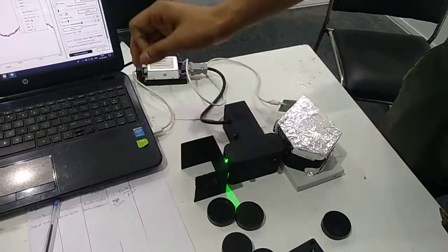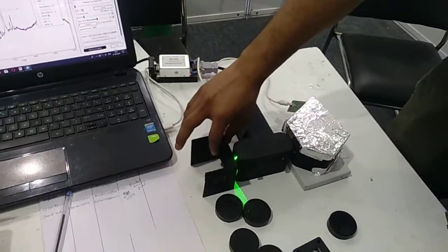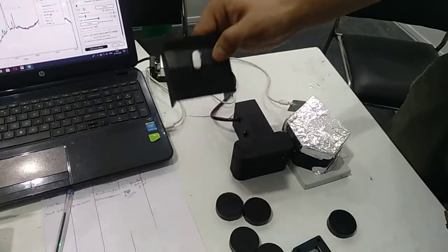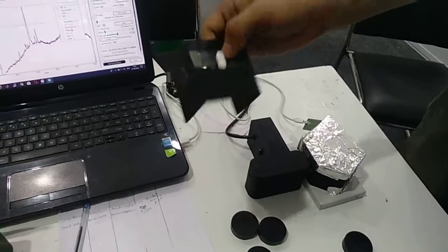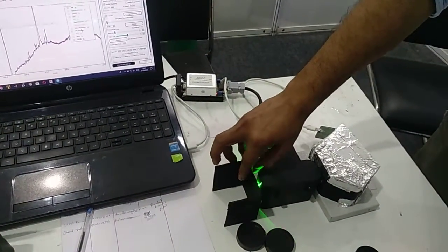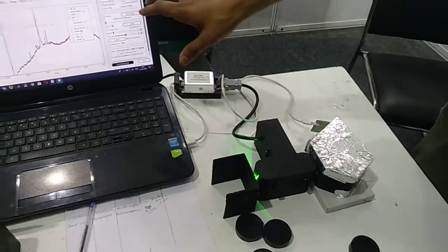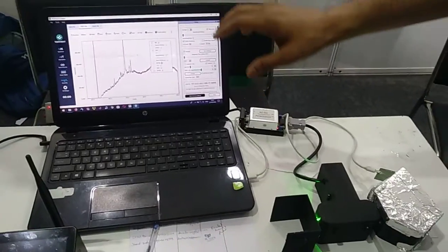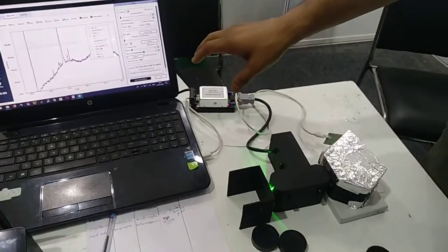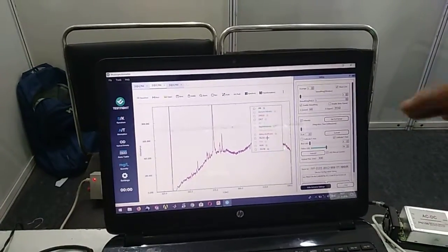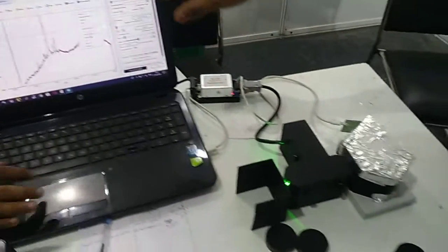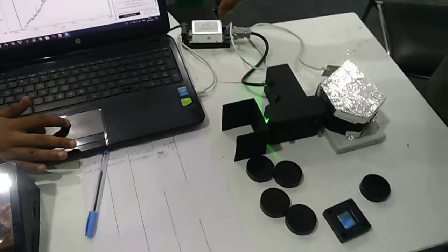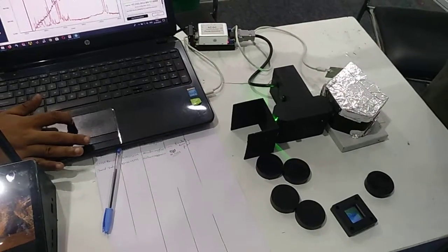We have a pharmaceutical drug that we're analyzing. We have a paracetamol tablet. We can detect any drug or explosives, any powder, whether it is a pharmaceutical drug, illegal drugs like cocaine, or explosives. It can be used by authorities or Homeland Security.